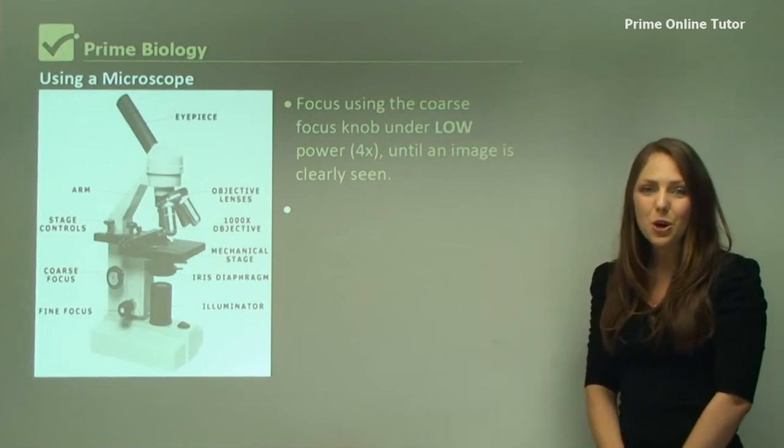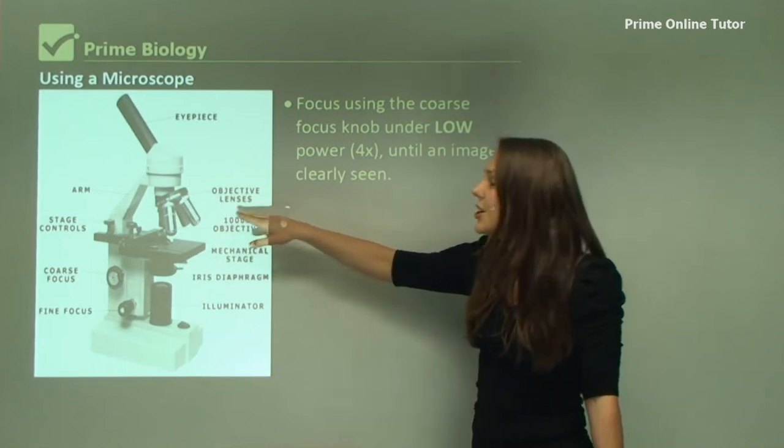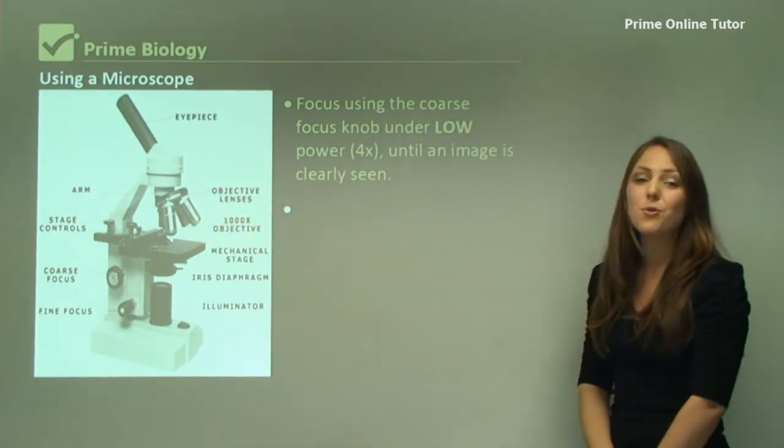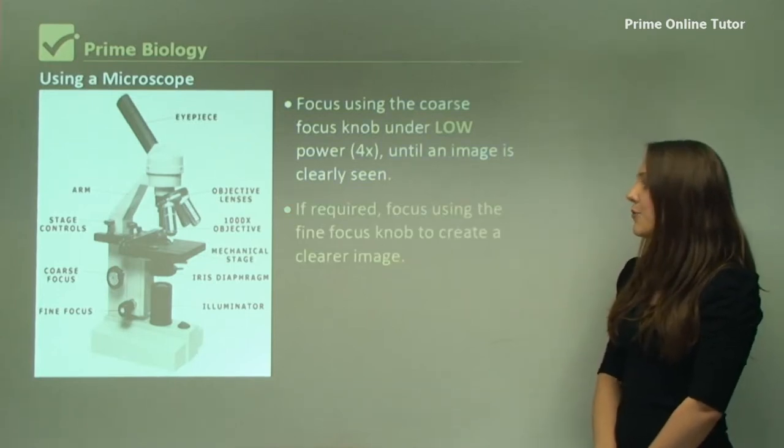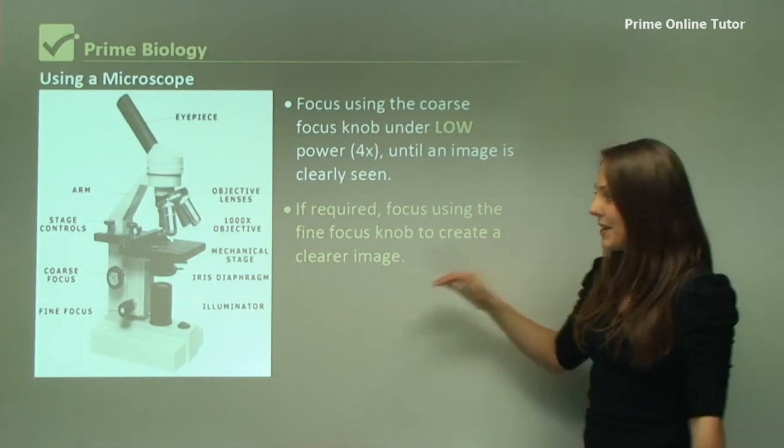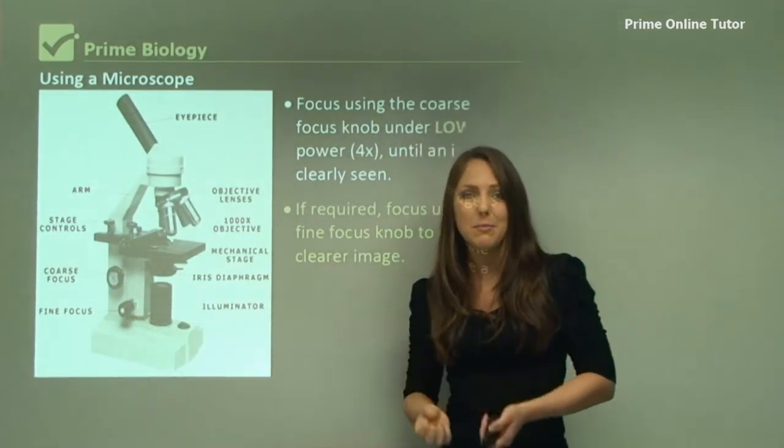You need to focus on the low power first. You do this with the low power objective lens. So you turn this to the smallest objective, which is 4x magnification. If required, focus using the fine focus knob to create a clearer image. Here's the coarse focus, and the fine focus makes the image a little bit clearer.